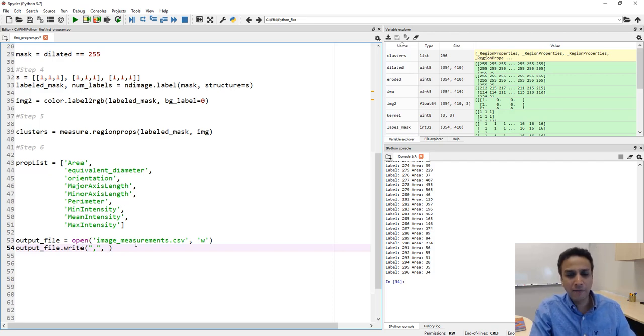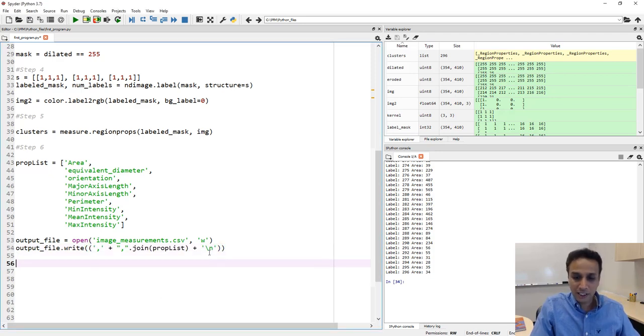I'm doing this because I've done a couple of things before, and I thought this is the best way to deal with this. So I'm not experimenting during this video. I've done that already. In fact, let's go ahead and copy and paste this so I don't type anything wrong. So there you go. This is what I just did. This is nothing but a comma. It's going to add this prop list, which is nothing but each one of these, and then it creates a new line after it's done. That's all it's doing. And we left the first cell blank to leave room for the header, meaning the column names.